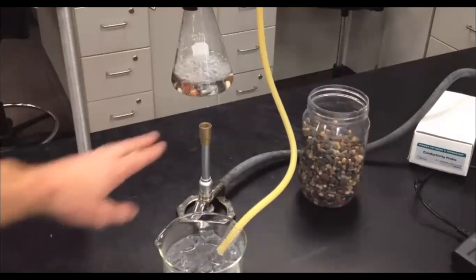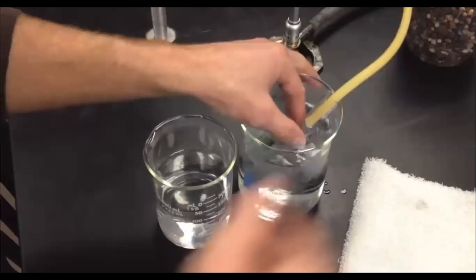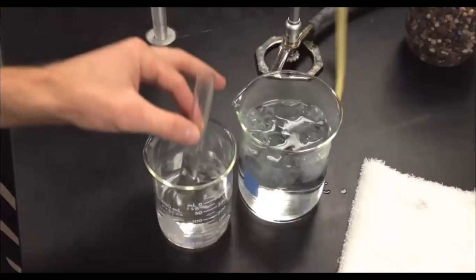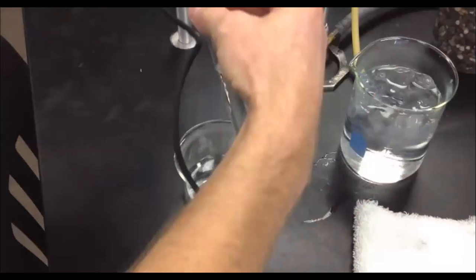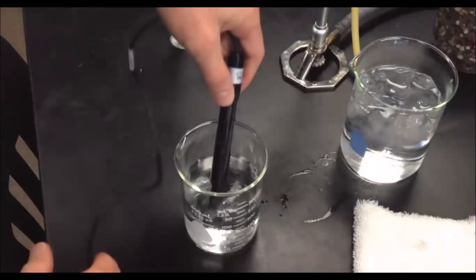And we want this to be in room temperature water, not ice water, so I grabbed another beaker. I'm going to fill that up with, carefully so that you don't burn yourself, transfer your distilled water into that room temperature water. When a few minutes have gone by, place the conductivity probe inside the distilled water test tube.